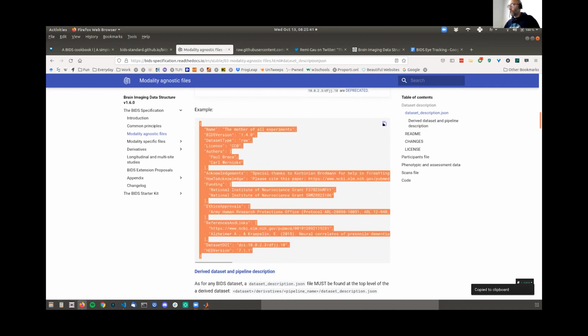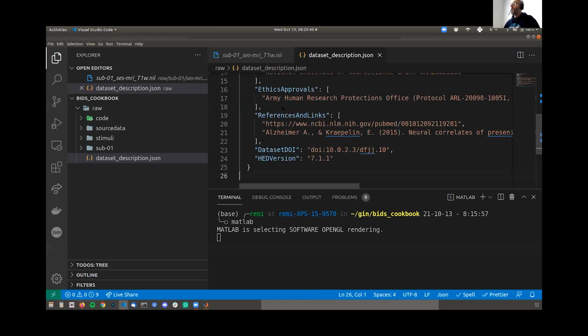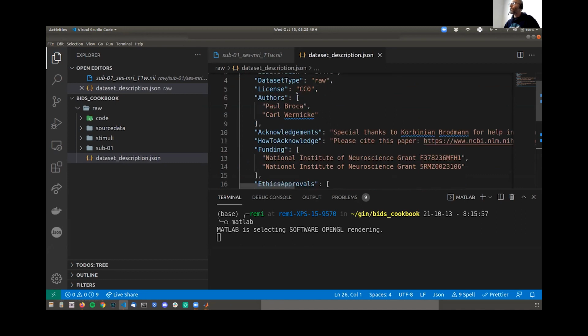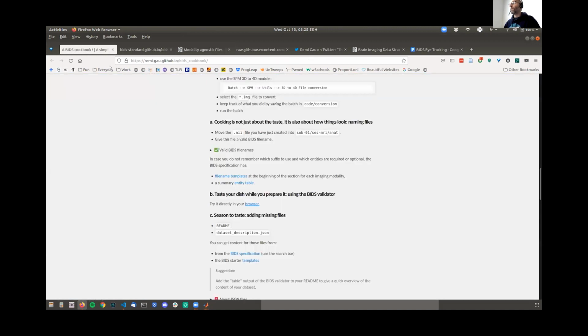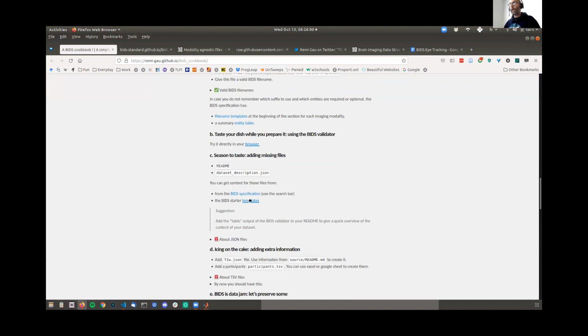For example, you can just copy this and add it in there, and then change the content of those fields to whatever you need for your use case. Another possibility is to use the templates from the BIDS starter kit.